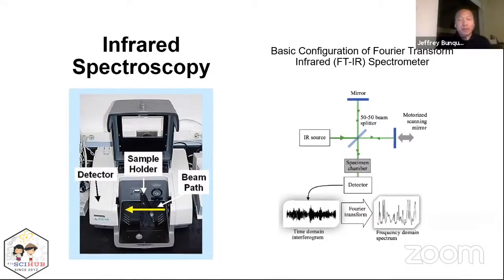Just one talking point to inspire our students, Dr. Dindi talks about an IR. She showed an IR spectrum. One very important thing that our students should have a fairly deep appreciation of would be Lewis structures, and then the concept of bond polarity, because these all have relationships with the types of the signals that you would actually see.